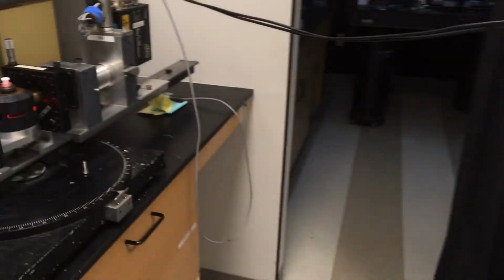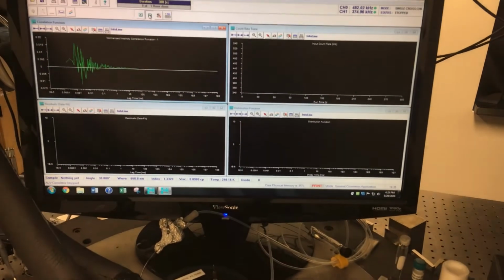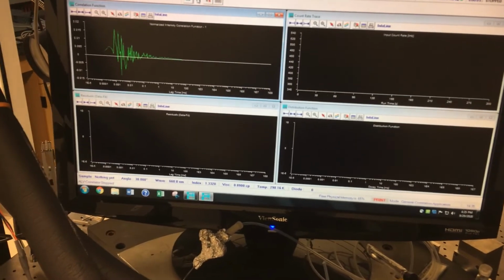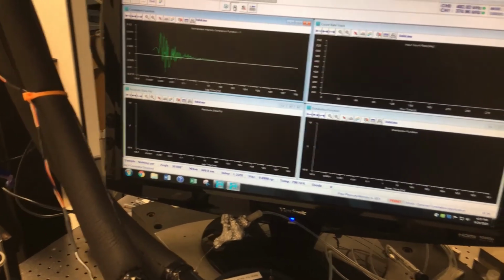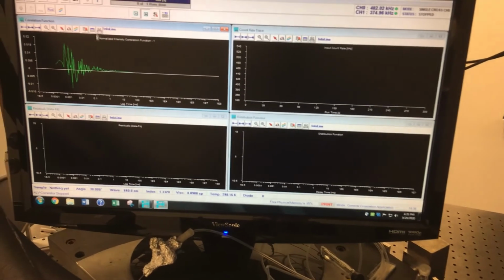So this is a heterodyne experiment in the sense that we're mixing light generated by the square fluorimeter cuvette itself with the scattered light, and we'll expect for that reason to have a very low optical coherence factor, apparent optical coherence factor.